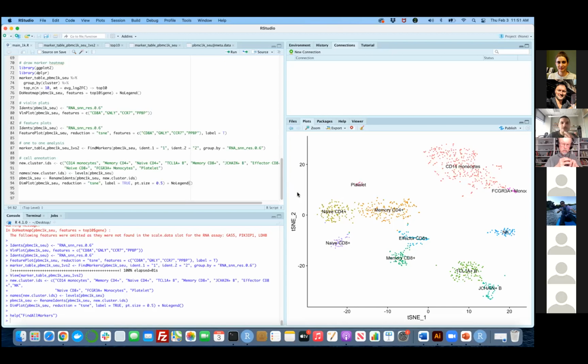But again, this is a question of the quality of your sample and the objective of your study, right? If you're looking at interactions of multiple subtypes, it doesn't really matter that you have only T cells. You have to have other clusters as well. So it's basically up to your experiment. But the assumption is that now you have some group of cells here, and you're just trying to find out what kind of subtypes you have in your data. Yeah. Thank you. Anything else? Anyone else?